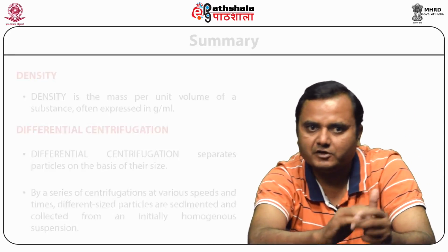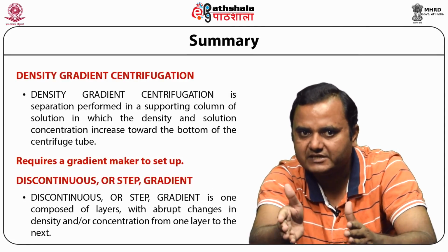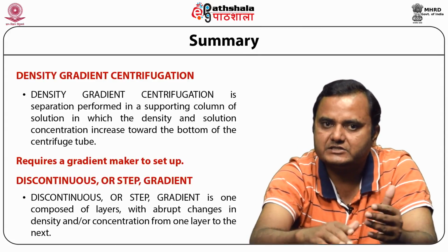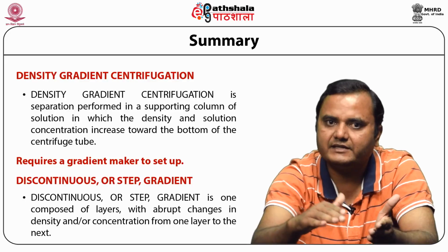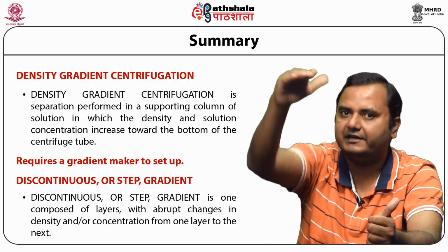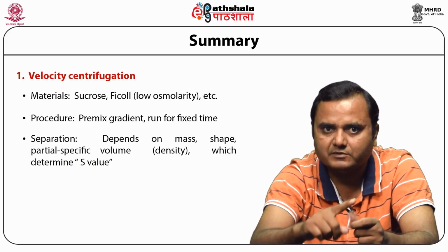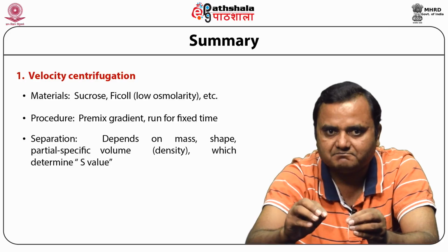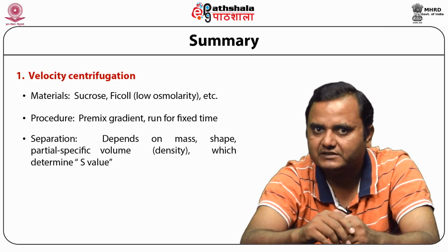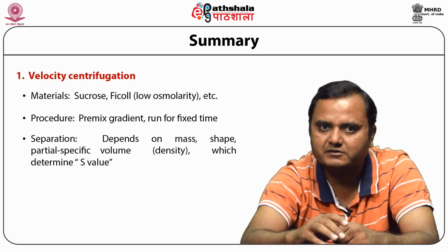We also discussed the discontinuous or step gradient, which is non-continuous and has a gradient with a sharp change from layer to layer. Then we also discussed isopycnic and rate or zonal centrifugation, two methods used for the separation of different molecules.